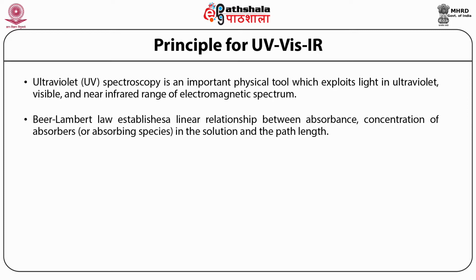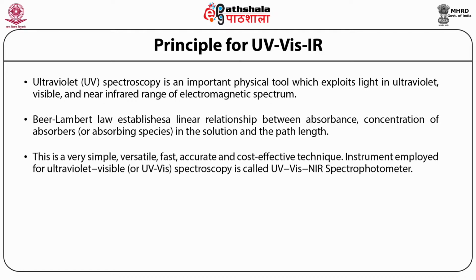Therefore, UV-vis spectroscopy can be employed for determining the concentration of the absorbing species for a fixed path length. This is a very simple, versatile, fast, accurate, and cost-effective technique.